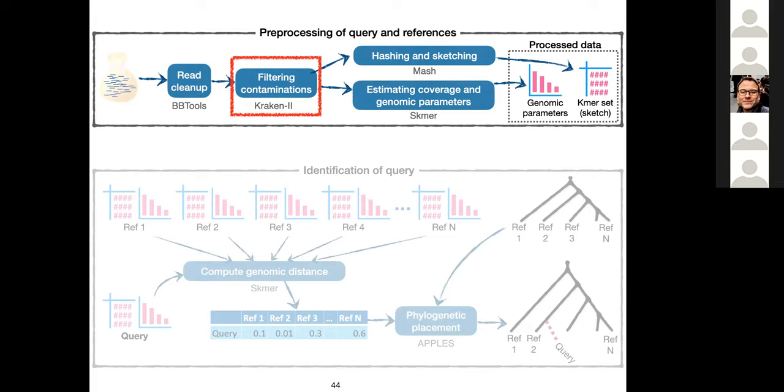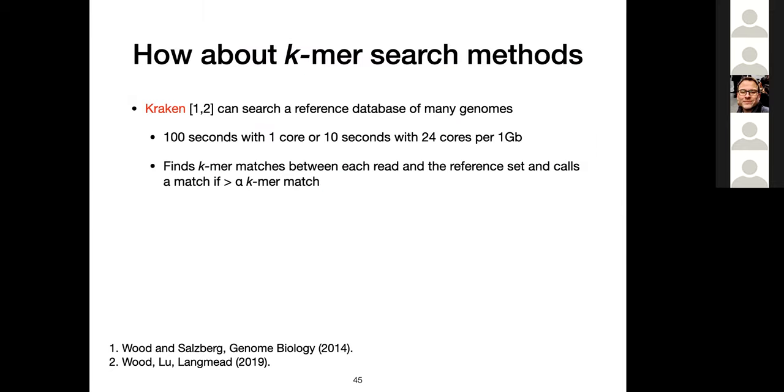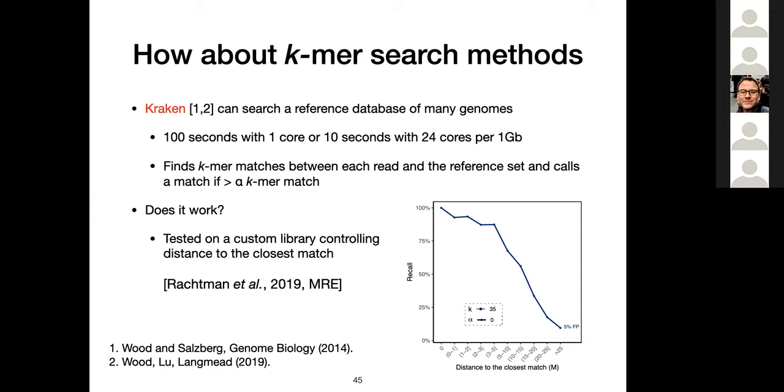Okay, so that's APPLES. There is this filtering step that I said I'm not going to talk about much. I'll just say that there is this tool Kraken that you can try to use for matching each of your reads to a reference library of bacteria. We did an analysis that was published in 2019 to see how good this method is.